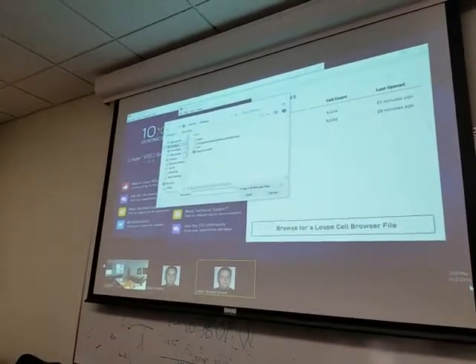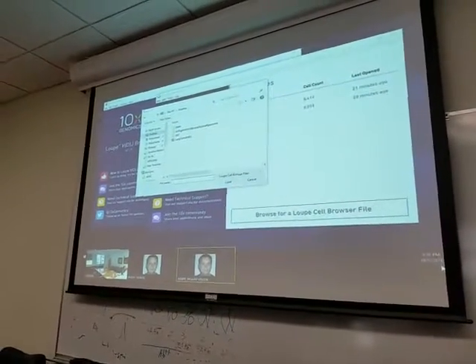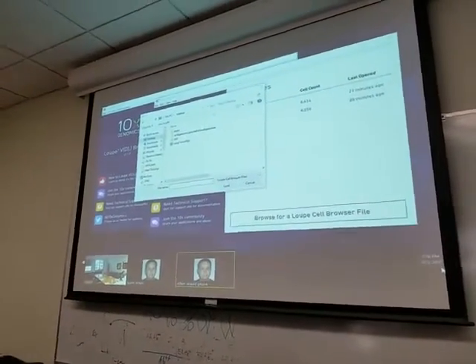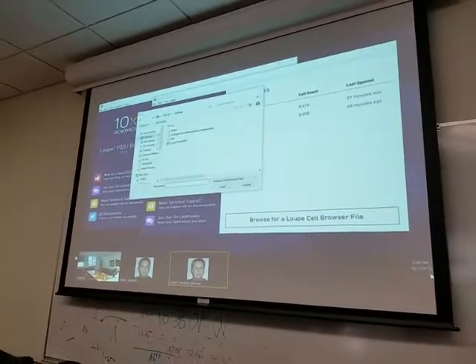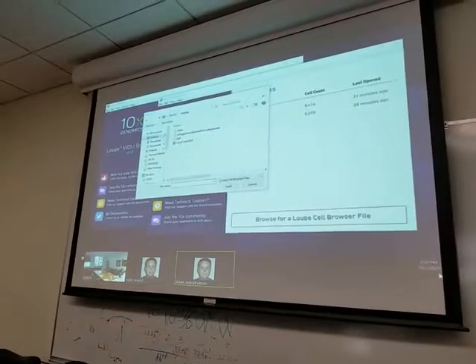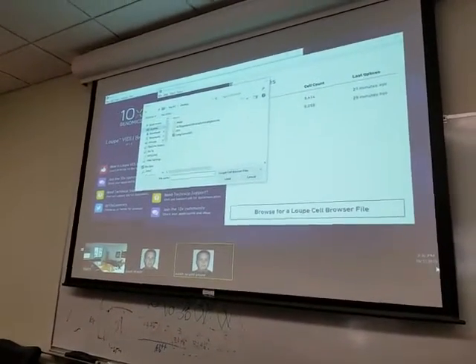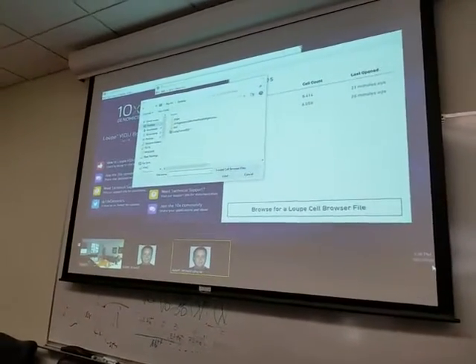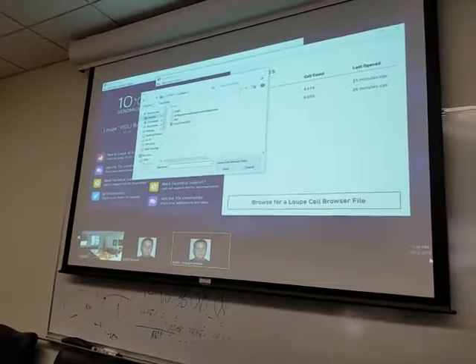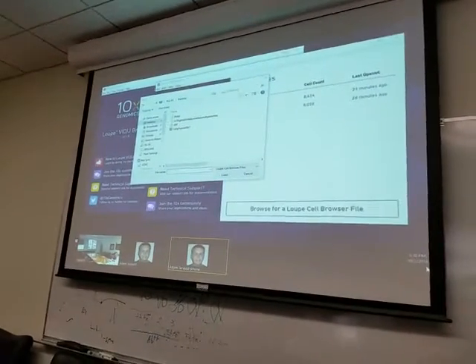Does someone at 10x, I mean, I know that Sherman was saying that you don't develop the software, but do you know who does for VDJ, for example? Is there someone there we can talk to and work with at least a little bit to get an analysis of our data? I mean, you guys are working on it. We just would like to talk to someone who's developing it, right?